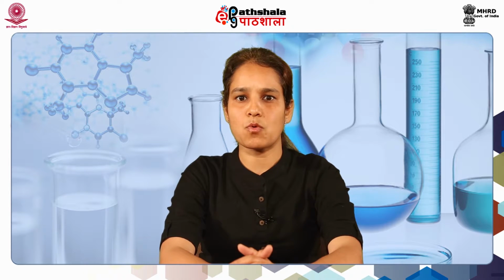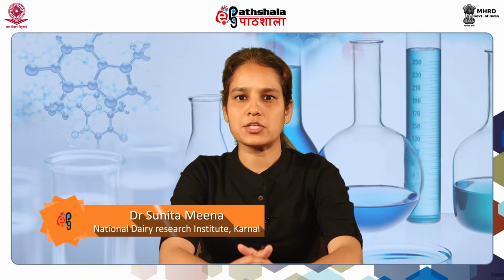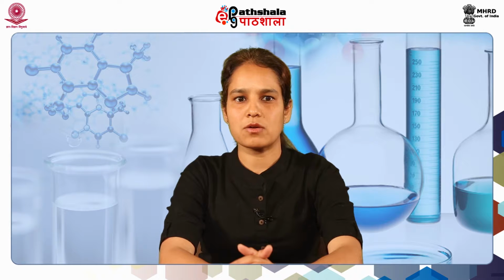If matter is exposed to light of varying wavelength, it will absorb light of a defined wavelength, and a plot between absorbance and wavelength is called a spectrum. The science dealing with determination of the wavelength which is maximally absorbed is called spectroscopy. UV visible spectroscopy is widely used for identification and characterization of organic compounds.